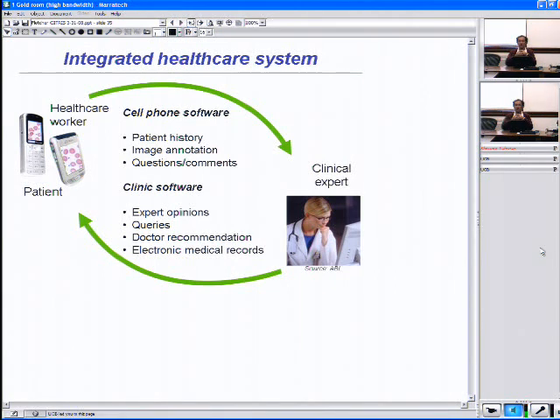Eventually, coupling this with an individual patient's electronic medical records would be quite useful. That is, the kind of information that's being taken, if it's of clinical significance, if tethered to the electronic medical records of an individual, can provide a way of looking at, over time, how a particular condition has changed, how a person's blood cell, white cell counts behave differently under different treatments.